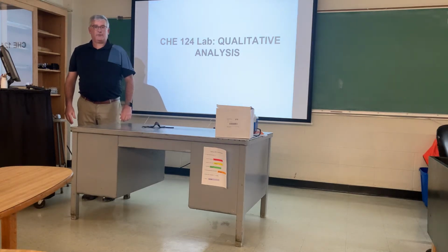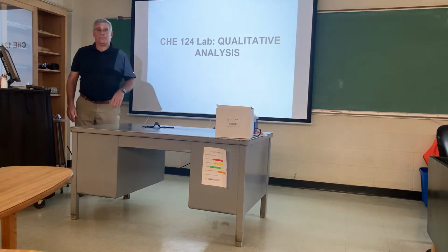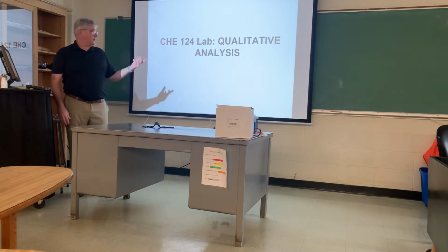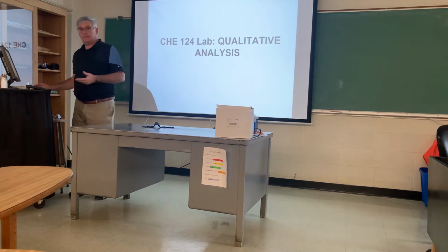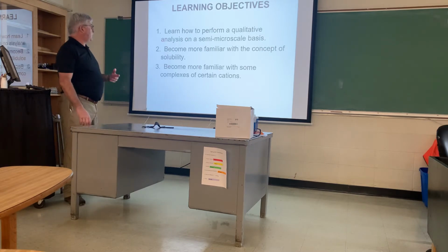Welcome to General Chemistry 2 Laboratory. This week we're going to look at an experiment in which we do qualitative analysis. Qualitative analysis is classic chemistry. It's wet chemistry, so we're going to do a number of reactions.